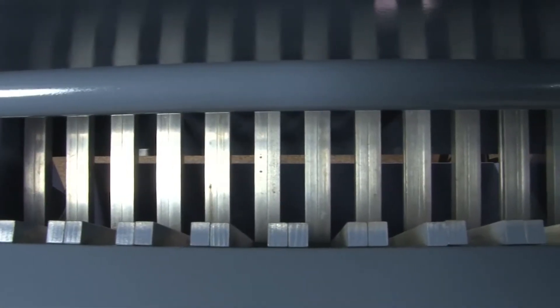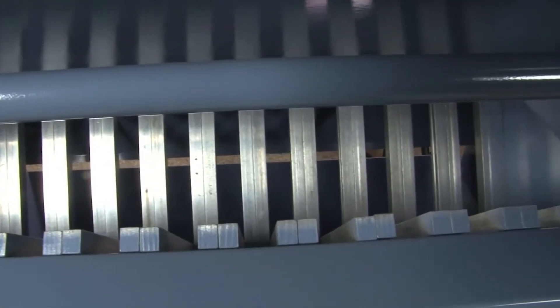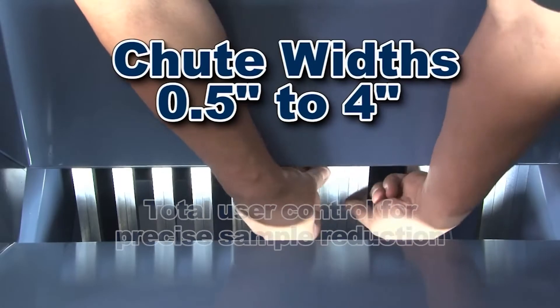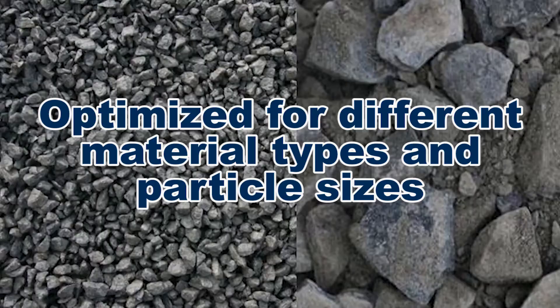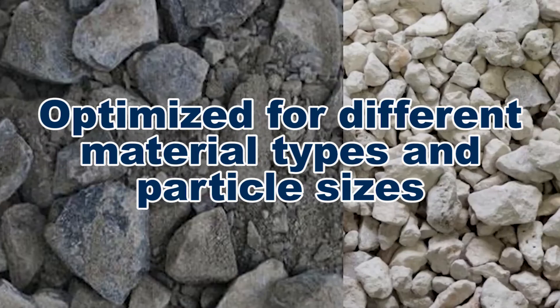The SB1 splitter chutes are formed by a series of individual bars mounted in a V shape. These bars are easily arranged to allow total user control of chute widths, optimizing the SB1 for different material types and particle sizes.